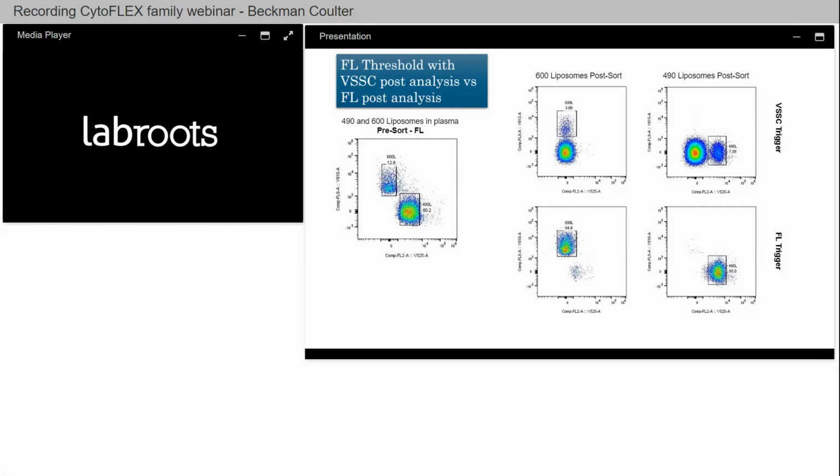The fluorescence trigger is agnostic of that because you're only looking for things that are positive. You don't get that real heavy background noise. So it is kind of just a workaround so that visually and numbers make sense.